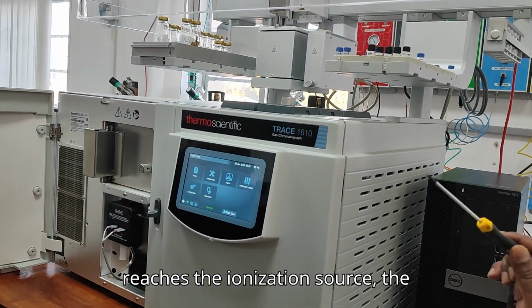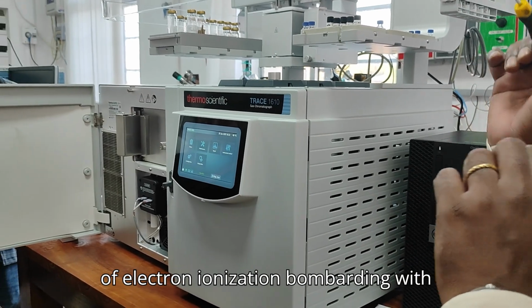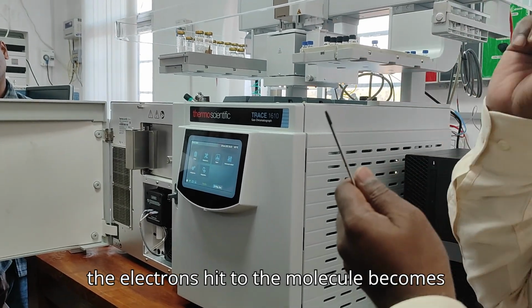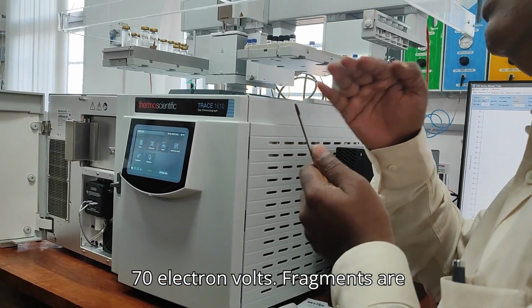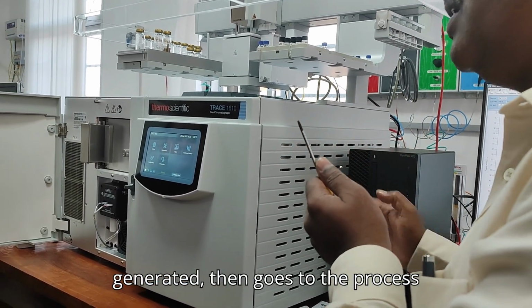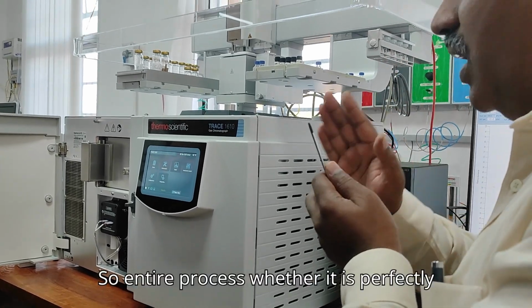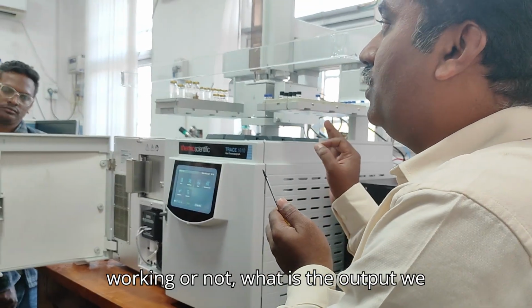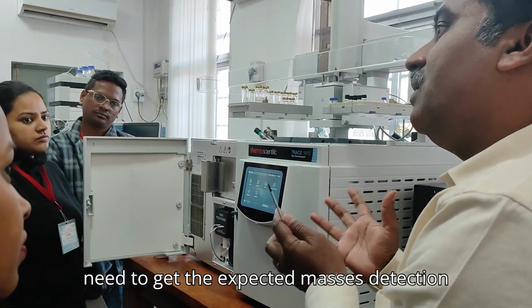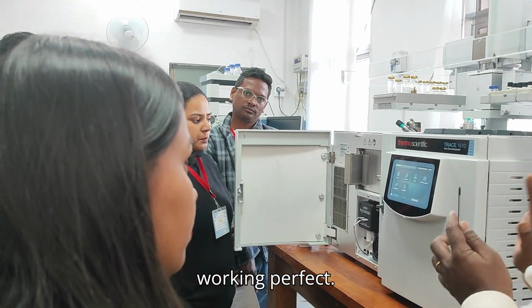Once it reaches the ionization source, the process starts. Electron ionization, bombarding with electrons, hits the molecule and becomes a molecular ion, then fragmentation with 70 electron volts. Fragments are generated, then go through acceleration, mass filter and detection. So for the entire process, whether it is working perfectly or not, what is the output? We need to get the expected masses detected at the specific sensitivity. Then it is working perfectly.